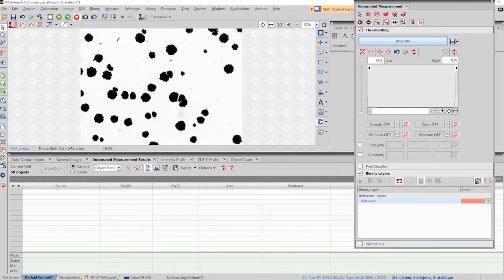Now one of these three buttons here gives us a very good, simple look at an initial thresholding. And that looks fairly good, but there's still a little black there, so I can make adjustments back and forth by sliding this line. And this looks to be pretty good.